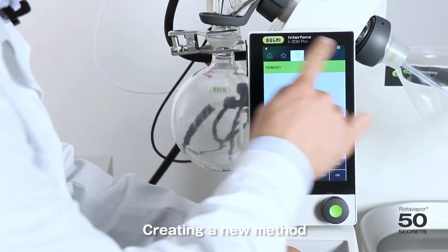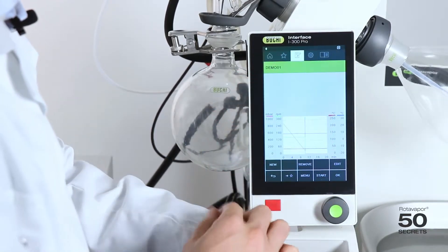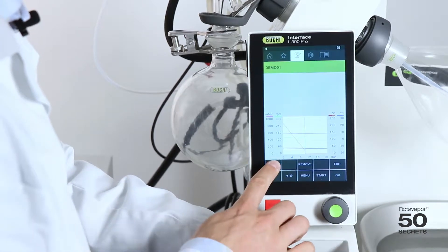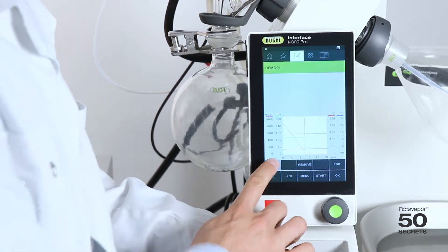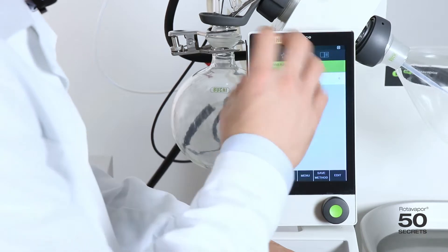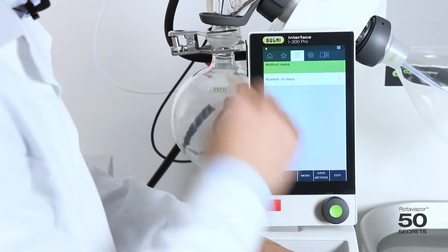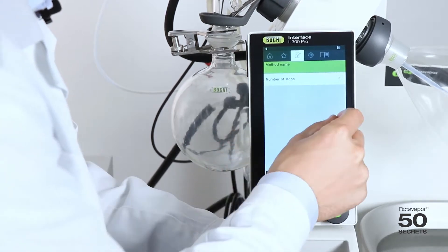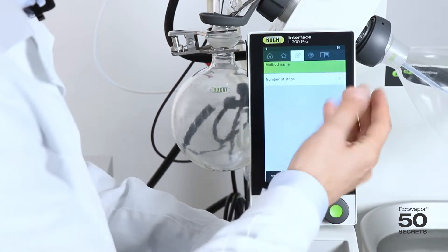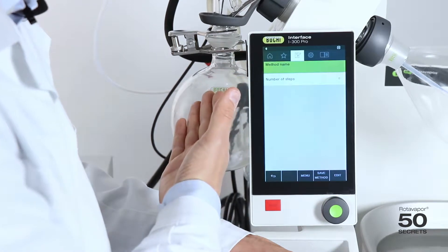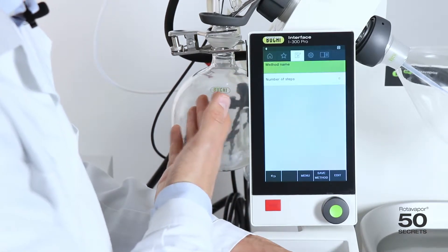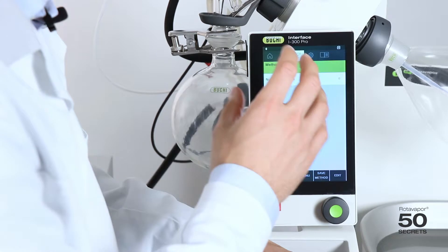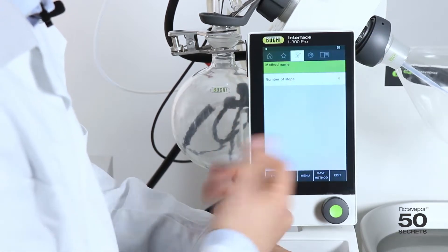We see already someone created a method here, but we want to create a new one. We would like to create a method which has four steps. The first step would be to go down from ambient to 100 millibar and then stay there for a few minutes. Then let the user replace the receiving flask and at the end we want to dry the sample. Let's do this.